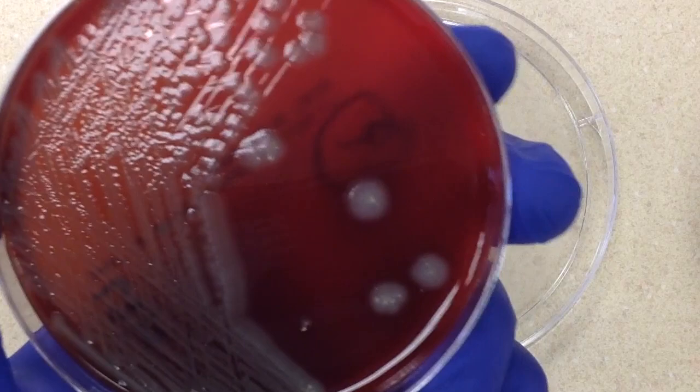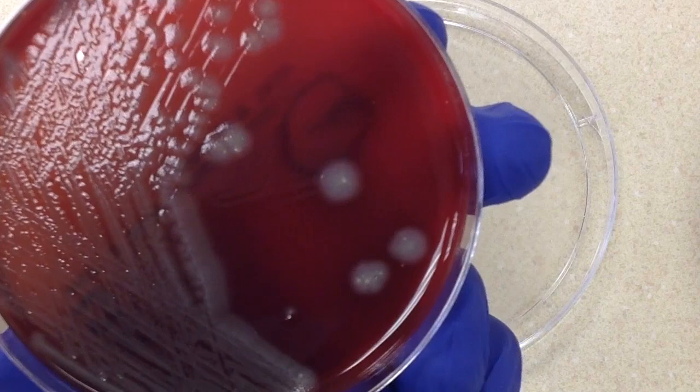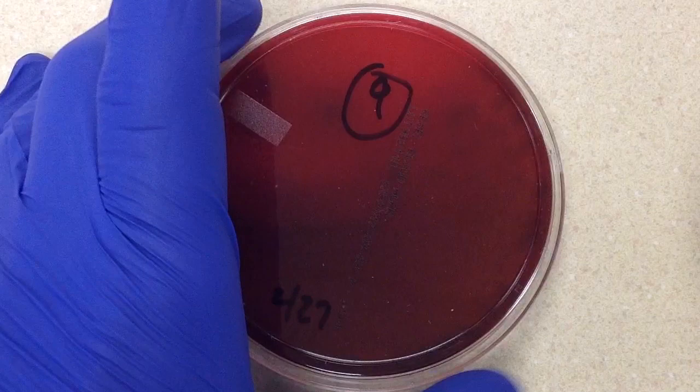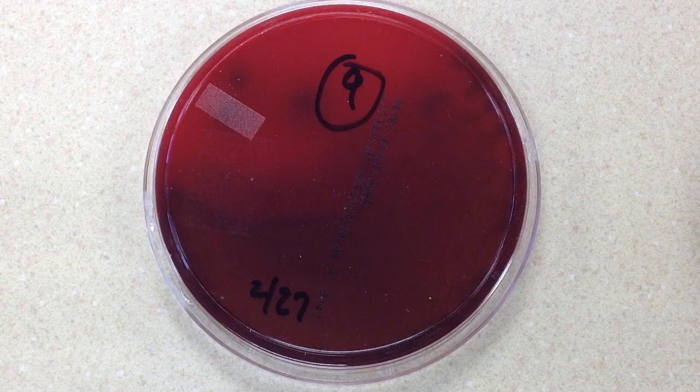Similarly to spinal fluid, blood is a sterile body site — a sterile body fluid — and we wouldn't expect any normal flora. What happens sometimes is that if proper technique is not used when collecting a blood culture, we can get contamination, since the needle goes through the skin. When contamination occurs, usually just one of the blood culture bottles comes up positive. But in this case, both are positive and we have a gram negative rod, which would be very unusual for a contaminant. We're not going to assume this is a contaminant.